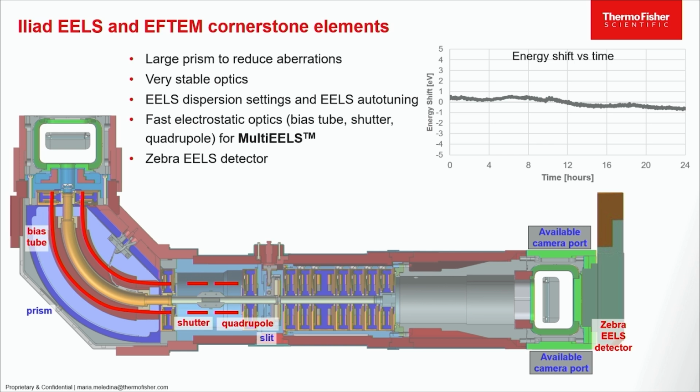And here is a little illustration which I took from our life science colleagues, because they were measuring the stability of the filter for super long times. And you can see that it's super stable. The only bump you have here is when they are refilling the nitrogen.